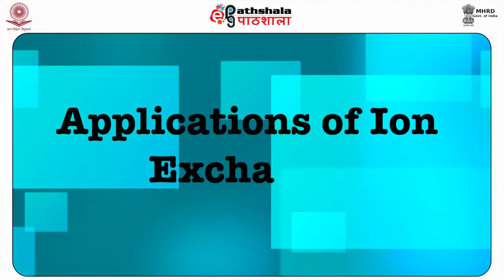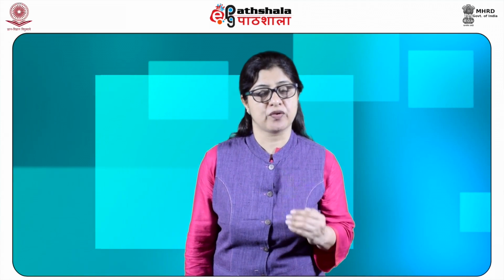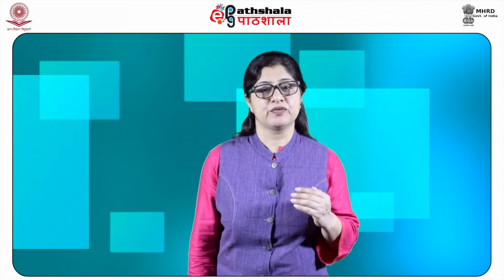Applications of ion exchange. Because of the particular selectivity of the material, separation with ion exchange is used. Organic ions which form salts with oppositely charged ions in another phase can be separated too. Almost all ion exchange reactions require aqueous solvents.